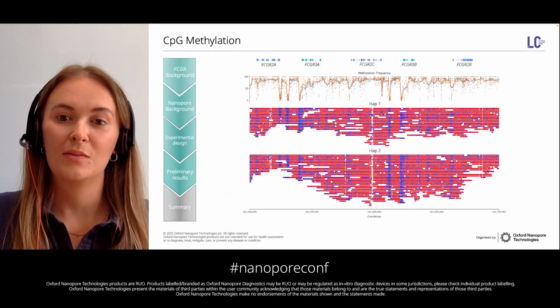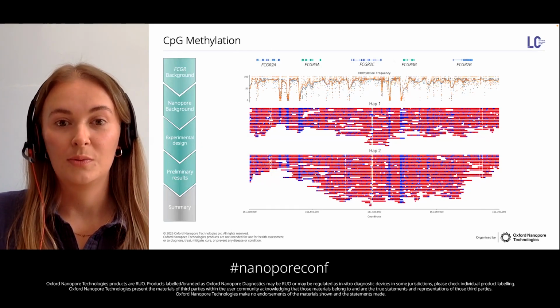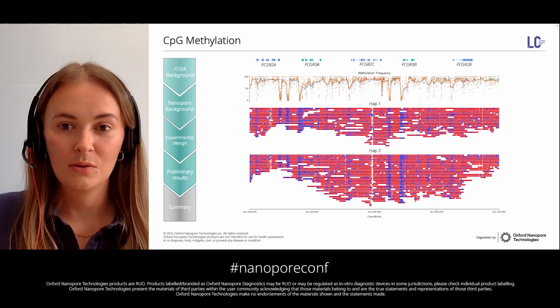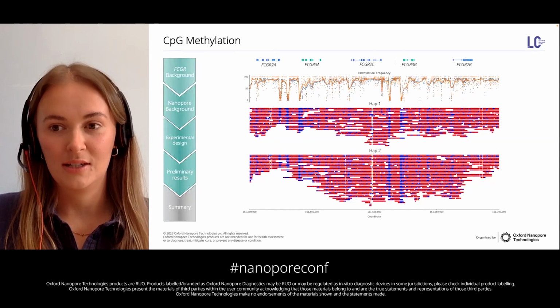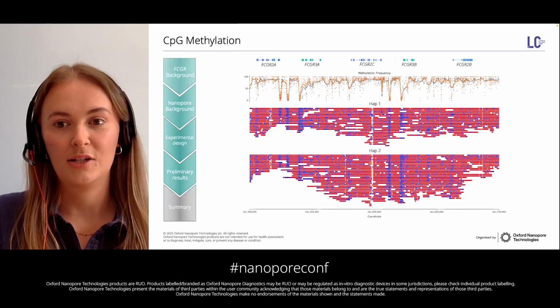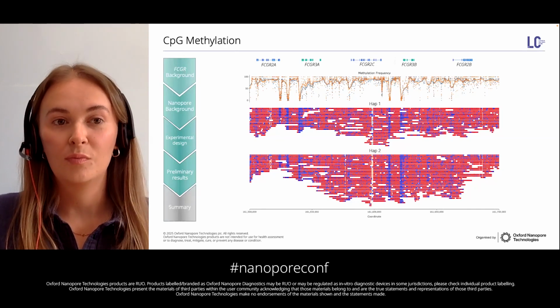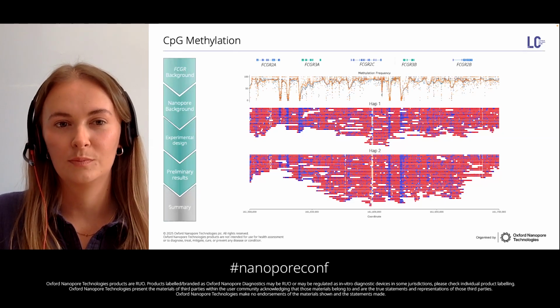And finally, we're also exploring methylation in a haplotype resolved way too, as Nanopore makes it possible to get methylation data straight out of base calling with no extra prep time or costs. Once we have high quality assemblies, we're able to map reads with their molecule-specific methylation marks back, giving us an unprecedented view of regulatory modifications and how they may influence expression.